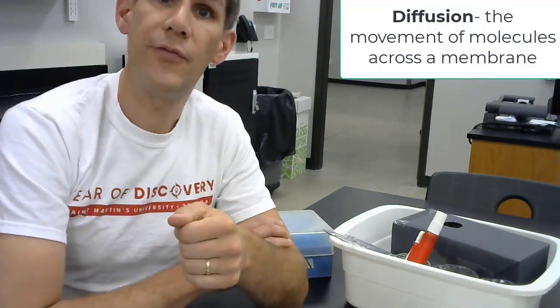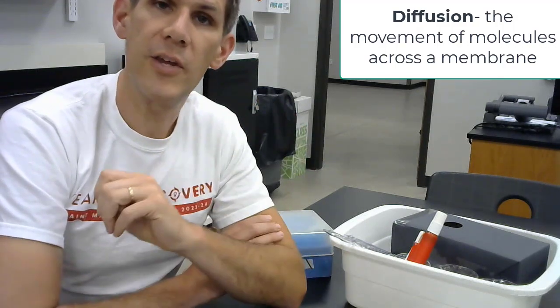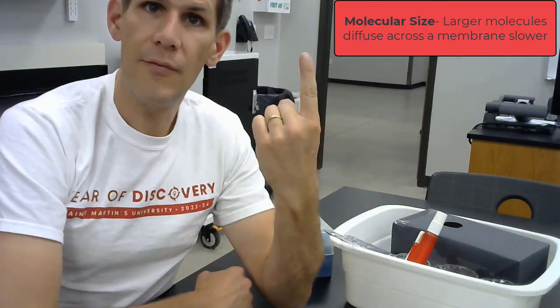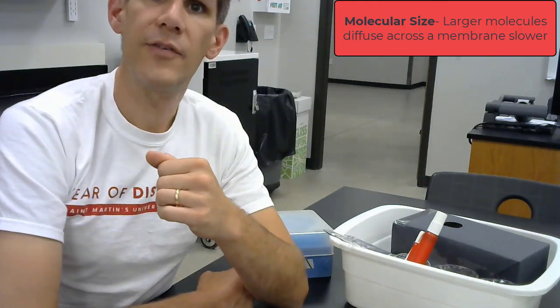In the second part of the lab, we are going to measure diffusion. This is not when water is moving, but this is when molecules are going to be moving. Now, molecules can move across a cell membrane based on three different factors. First off, their size. Larger molecules move across a membrane slower.